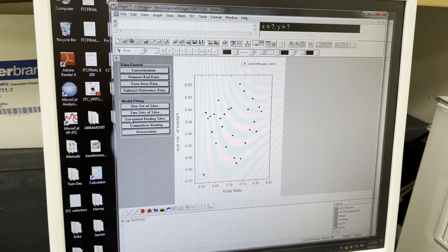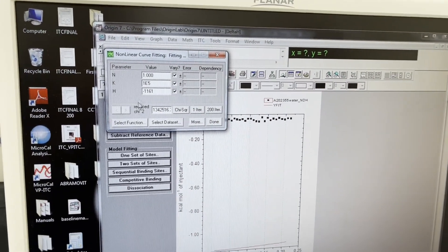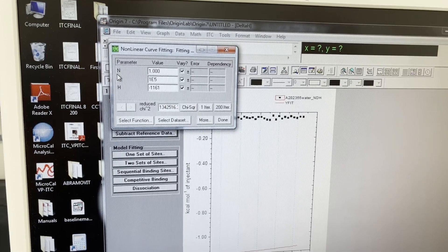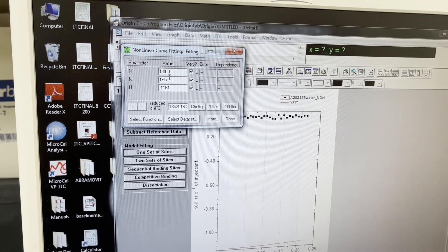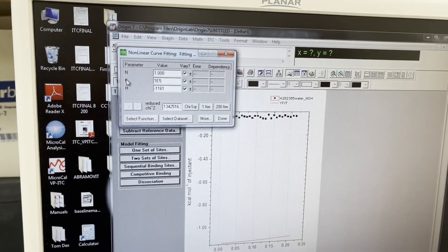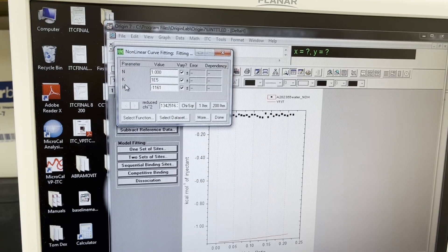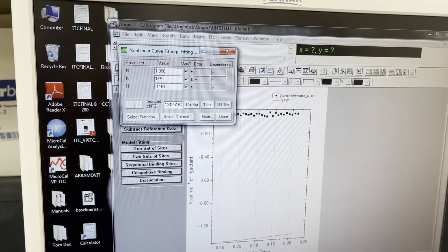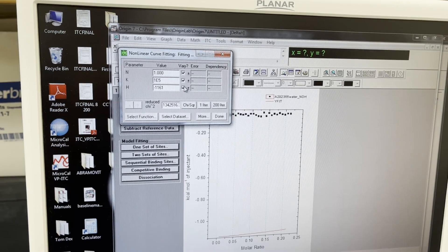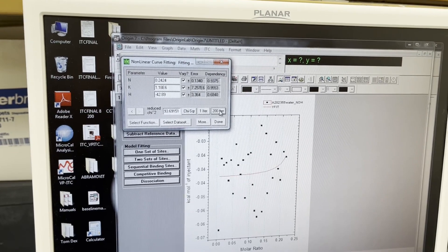There are several different choices in binding models. One set of sites, two set of sites. You can look up the math for all of it. N refers to the molar ratio. If you have a one-to-one binding situation this would be close to one. K is your KA so it's your K association. And H is enthalpy. You can change these to have different starting values if you would like. You can fix one or you can have them checked so they can vary. Basically all I do is hit 200 iterations.